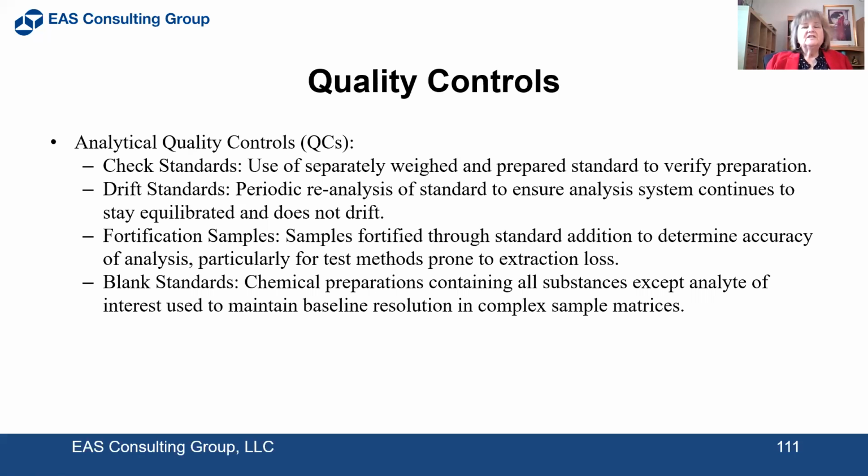You have fortification samples, samples that are fortified through standard addition to determine the accuracy of the analysis, particularly for test methods that are prone to extraction loss or matrix effects. Blank standards, chemical preparations containing all substances except the analyte of interest, to be used to maintain baseline resolution in complex sample matrices.